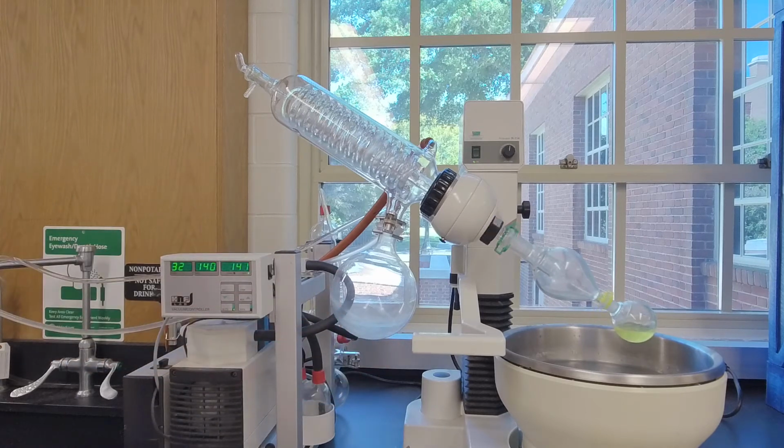Now, what happens when a substance evaporates? How does sweat cool you, right? Think about sweat. It's a hot day outside, you start sweating. Why? Well, the way sweat cools you is it evaporates. And when something evaporates, it takes some heat to convert the liquid to a gas.